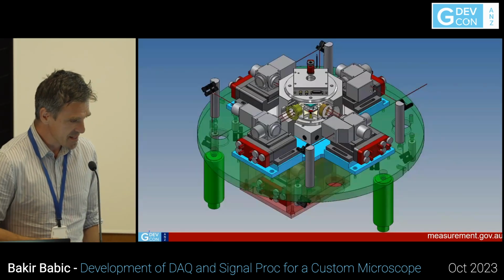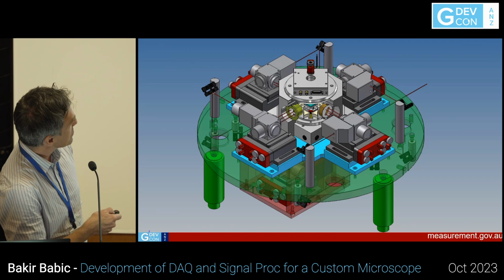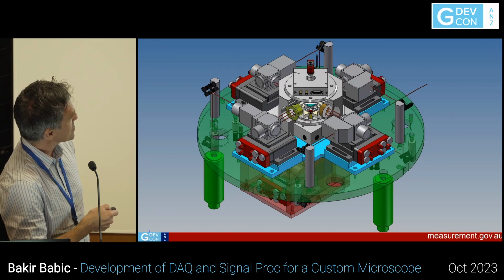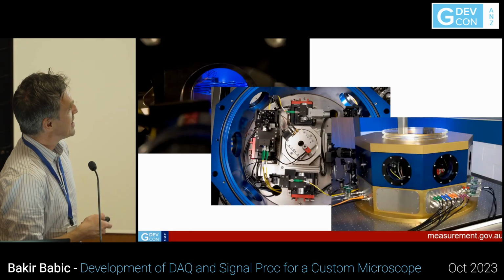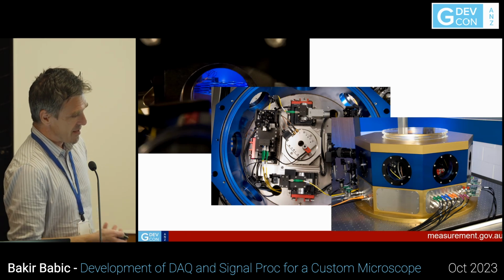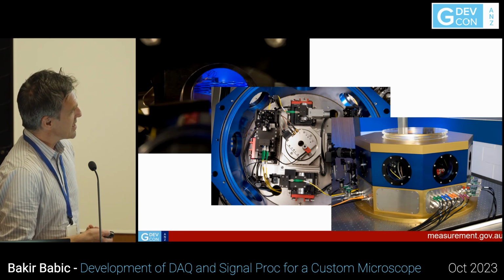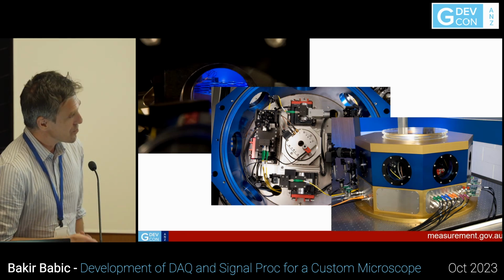Okay, so this is the instrument. As I already mentioned, through laser interferometry we get traceability, but there are lots of mechano-optical, electrical parts which go into it, and that's real. I'll just show you here. It's essentially an atomic force microscope with a well-controlled environment and interferometry.